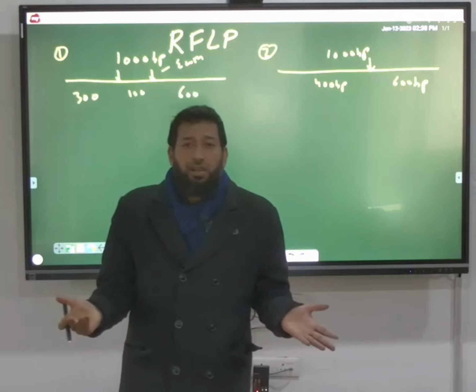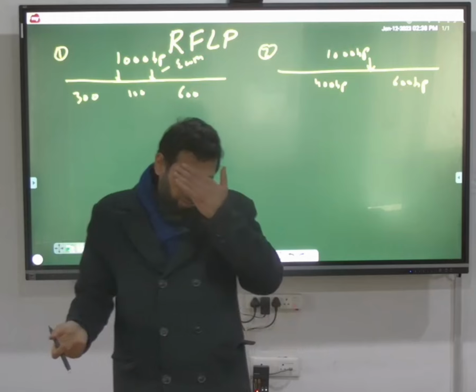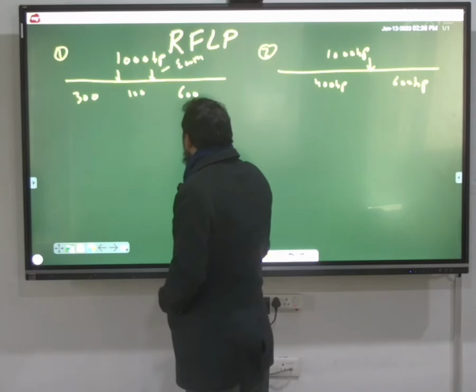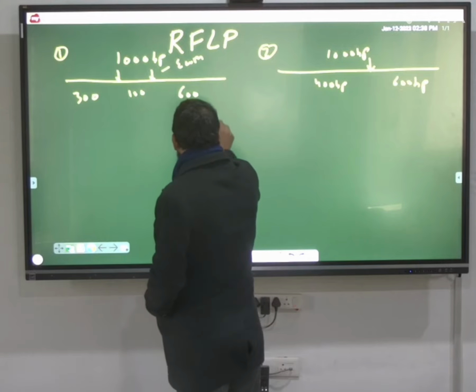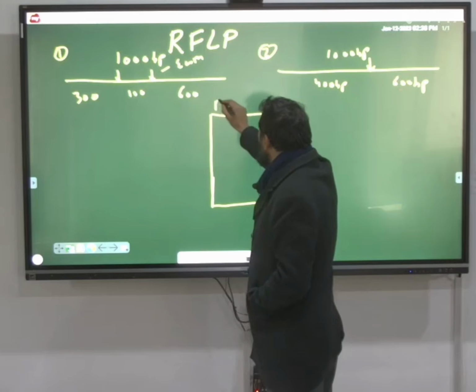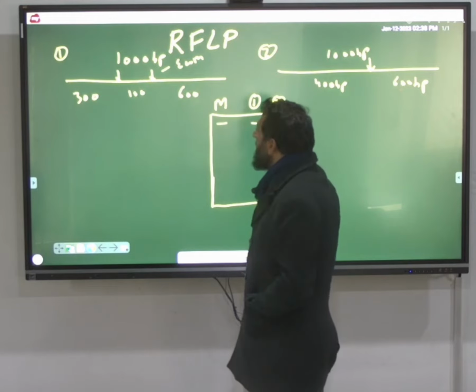run them in a gel, we have restriction digested, and now just run the DNA in an agarose gel electrophoresis, and what will happen? So this is your gel, this is your marker or ladder, this is your number 1, and this is your number 2 lane. These are lanes.